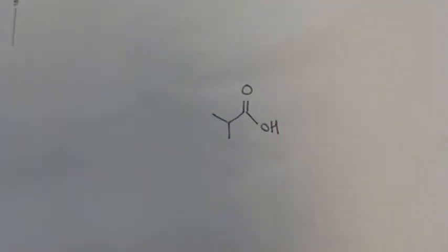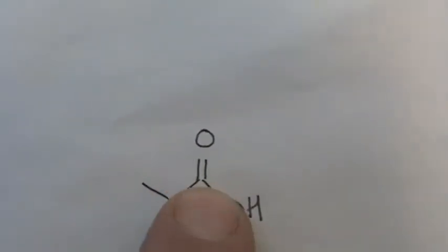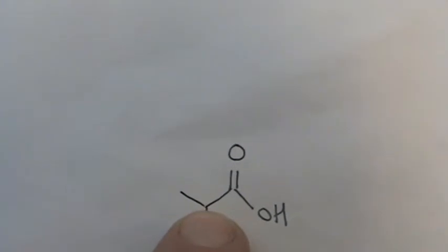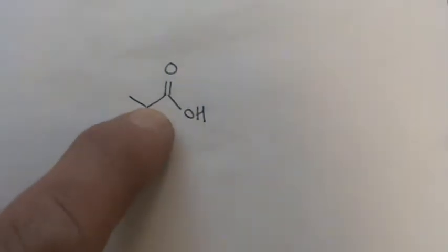C13, you expect to see the carbonyl carbon, that carbon right there in the middle, and then the 2 methyl groups. So obviously the 2 methyl groups is this one. This one, which is occurring at 33, has to be from that carbon. And then out at, now this one says 183. Don't forget, folks, this was run by a student on the isobutyric acid, but in any event, it should match 183 for the starting material.